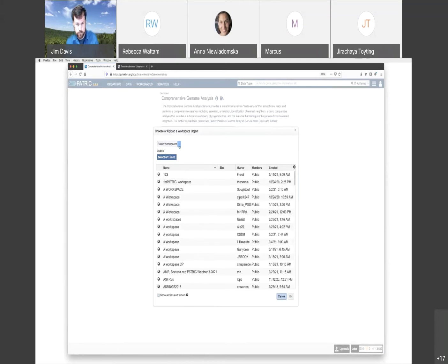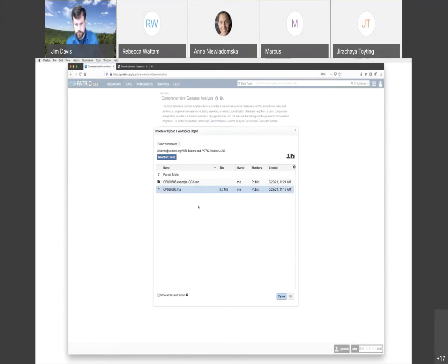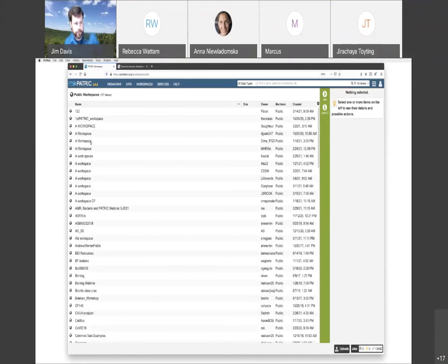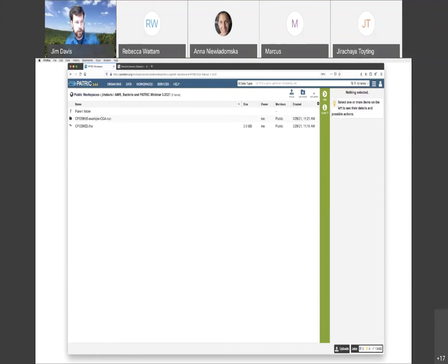Jim, just to note, I often have problems with the sharing from the public website, and I have been advising people to copy it over to their private website in order to use the reads. Oh yeah, that's annoying. Okay, well we can do that. You can show them how to copy. Right. So public workspaces. Let's go back here. Yeah, there's more than one way around this problem. We could download it and upload it too if we needed to.